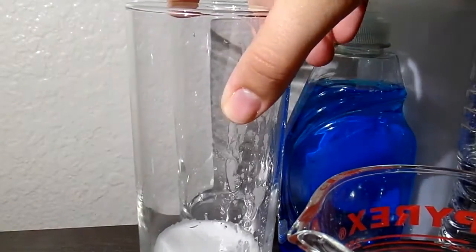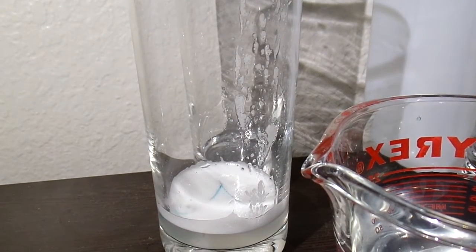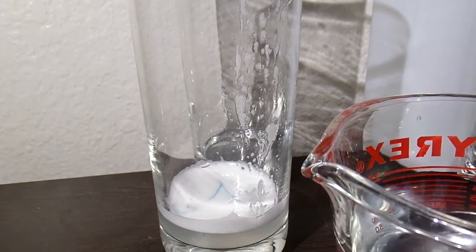After you're done gargling, you spit it out into the cup and you add a drop of dish soap, then you mix that. But you have to be careful when you're mixing because you don't want any bubbles.